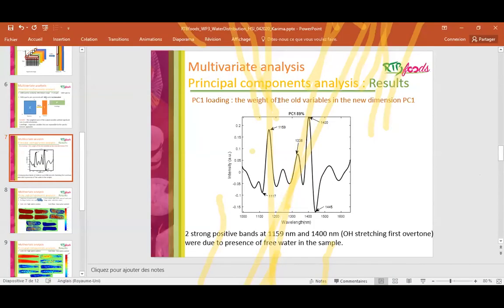Alamo, I think that Karima is just beginning with the equipment. The idea is to calibrate some components on cassava, yam, it's the same thing. And she planned to go to a different lab because it's a portable hyperspectral camera to do this calibration. But with the lockdown, it's a bit complicated at the moment, and she's doing some experiments to try the equipment. But in the future, we will have many components with good calibration.